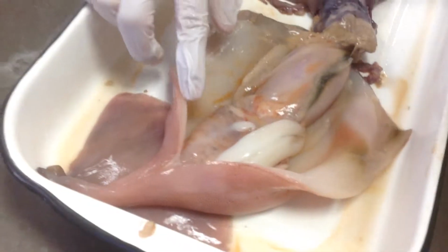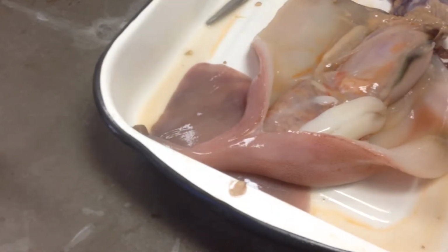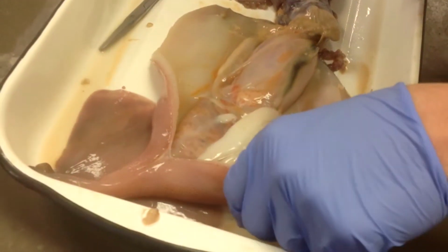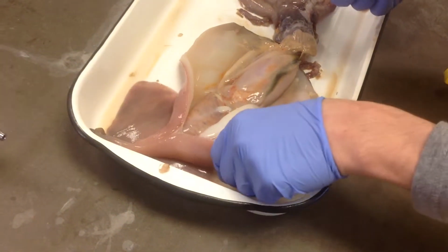Skin is thick. Looks like it has a layer of fat. Slimy. Yeah, it's slimy. It's fat, meaning slimy. Flexible. It also seems to have no scales. No scales. Oh, boy. We expected the skin to look really insulated, an adaptation to maybe avoid predators along with the cold.